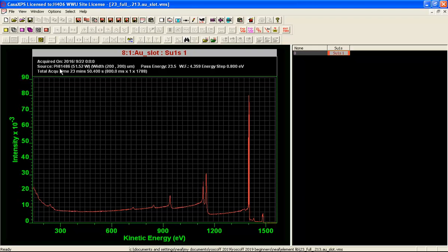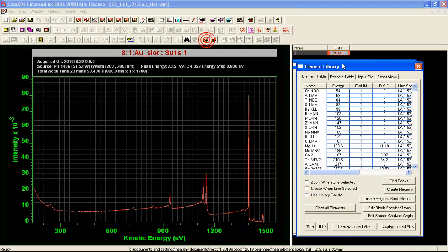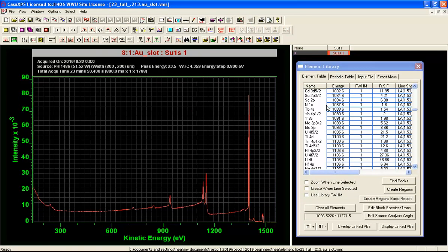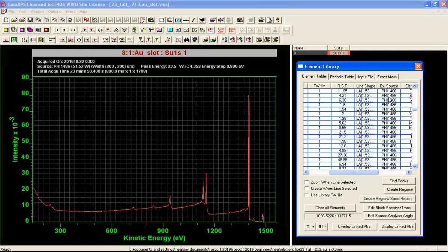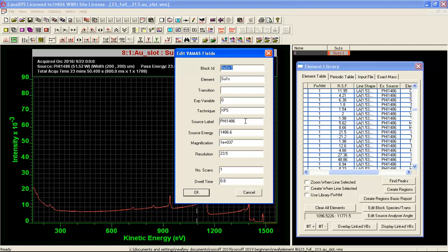The source label is then PHI 1486. When the element library is selected, the lines that are displayed in the element library correspond to the lines that match the source label PHI 1486. These values here match the value for the source label, which can also be seen in the block info. Here is the source label, the energy, and various other parameters that have been brought in, such as the resolution from the original SPE file.